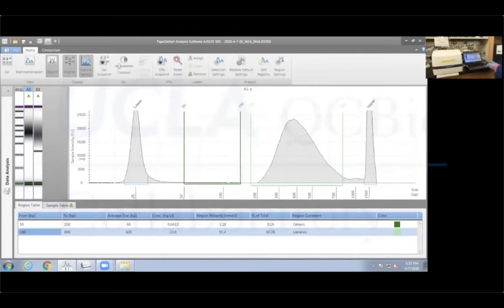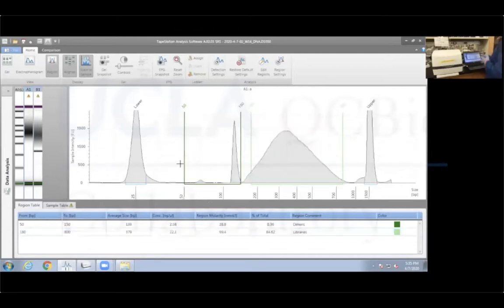So no need for further purification. If you go to the other sample, sample B1, then you have the amount of your dimers region. It's close to 9%, which is super bad. If you remember, the threshold that we usually set is 1%. If it's below 1%, we consider it quite good. If it's above 1%, then it requires further purification, okay? And in this region right here, you have your library, which is still high, but you have too many dimers, so you need an additional purification.